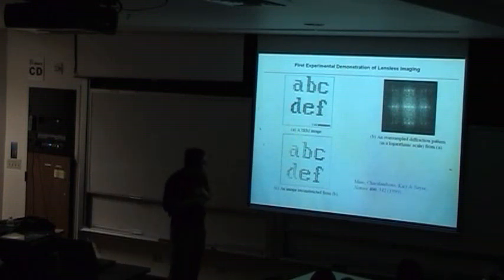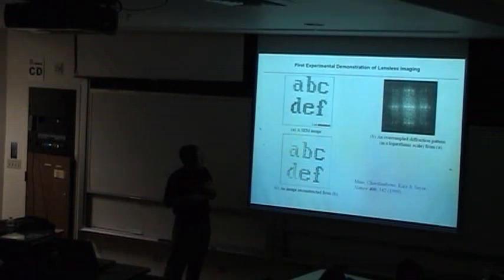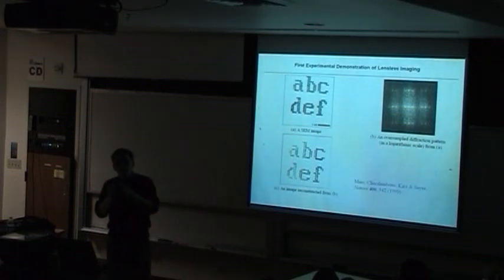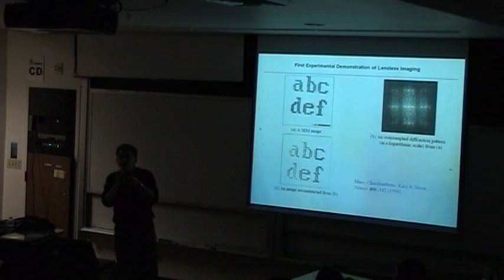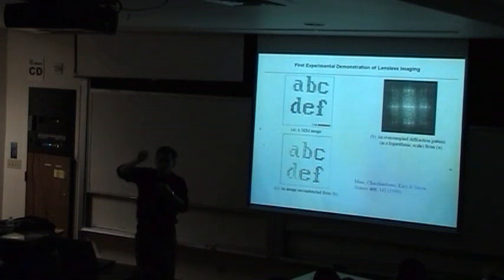Okay, so I just put them on the same scale. Then you can see the example very well. Now, you notice the contrast is very good. The reason, I thought about it, is that in a conventional microscope you have the DC term, which means the electron beam overlaps with the scattering wave. The scattering wave is many orders smaller than the electron wave. It's just like a ripple in an ocean wave. It's very difficult to tell the ripples.